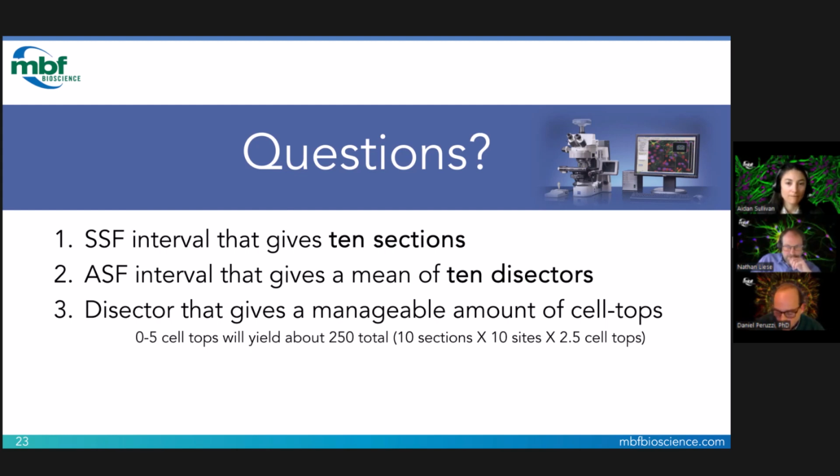We're going to look at a Z histogram, for instance. We're going to look at the data. Because of what you say, we are counting the cells that have seen artifacts, so we want to look at the data and know how to cover those cells up. And so when we actually do the experiments and count all the animals in each group, we will be using guard zones to guard against the artifact areas.